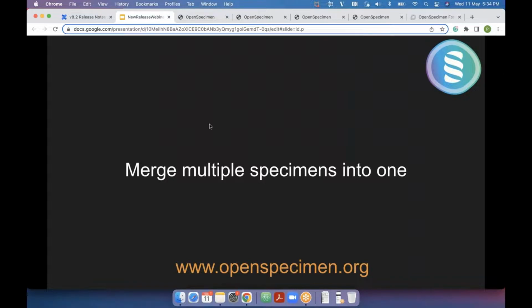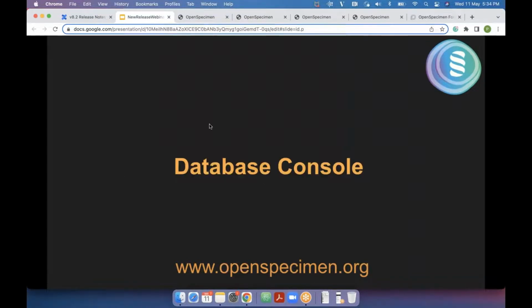And this can be, as I said, pool specimen also can be part of the main workflow steps as well. Yeah. So any questions on that?